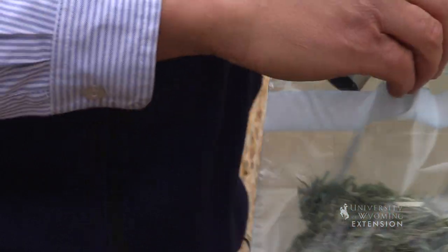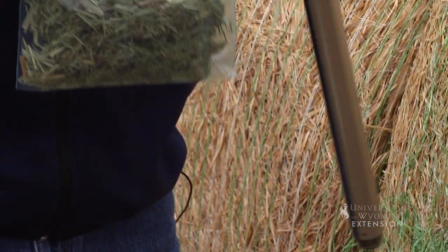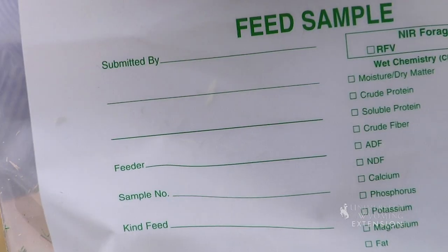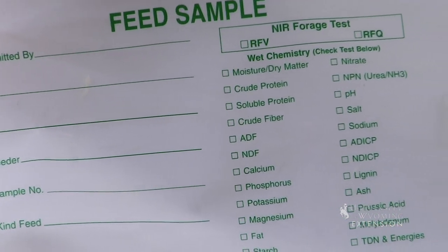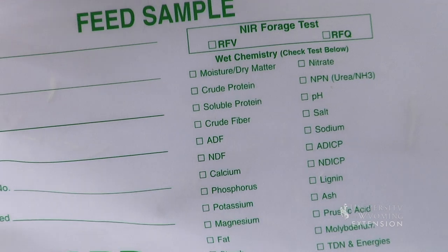Take that core sample and dump it into the bag, then add all your additional samples into that bag. We would encourage you to put your name and address as well as the field where it came from, whatever type of labeling you need, and send it off to either your commercial lab or the Wyoming State Forage Testing Laboratory.